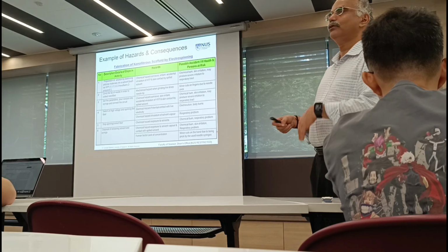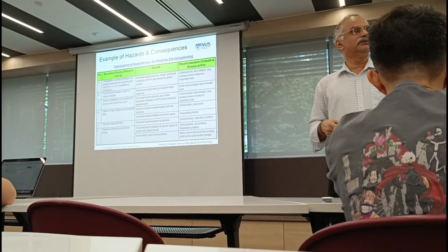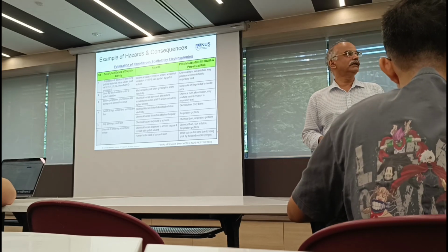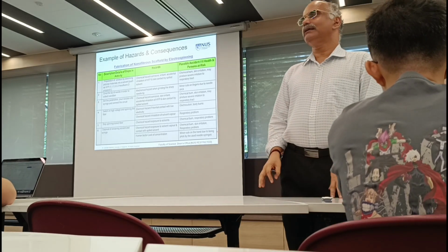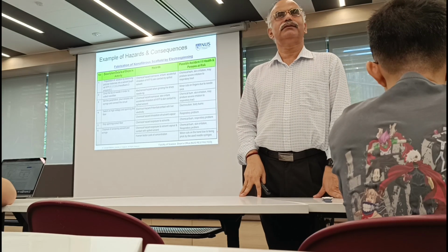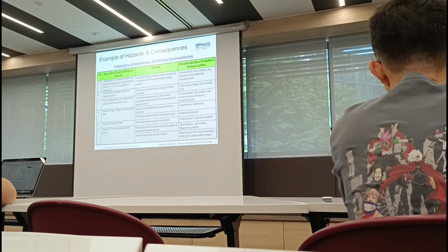This is even more exotic, like electrospinning. I don't think we are doing it. We used to do it in the old days, but now we go to another lab and do it. Other labs in chemistry are not doing it at the moment, as far as I know. It is a way of making nanofibers based on high potential, right?